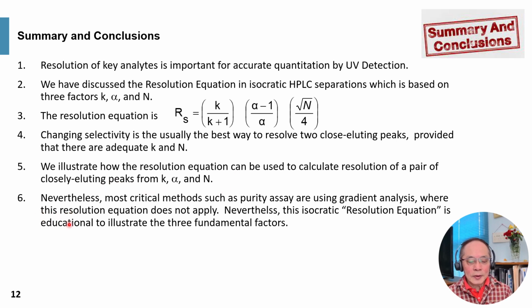Finally, I want to point out that most critical methods, such as drug product assay or stability-indicating assay, are using gradient analysis. In those cases, this resolution equation does not apply, unfortunately, because things are much more complex. Nevertheless, this isocratic resolution equation is really educational for a chromatographer to illustrate the three fundamental factors affecting resolution in chromatography.